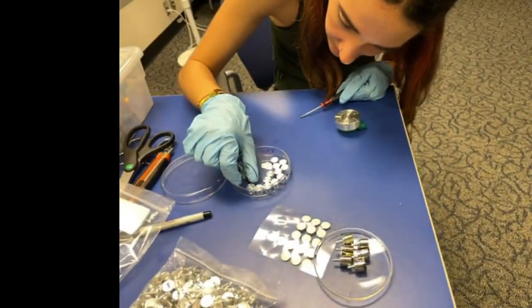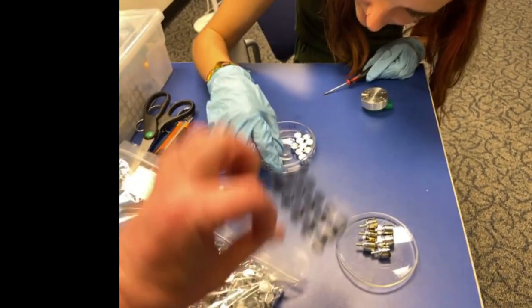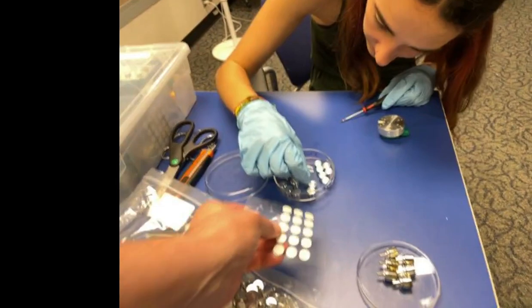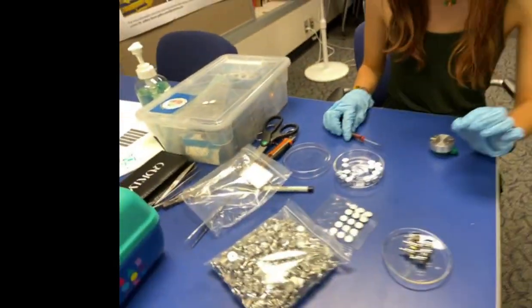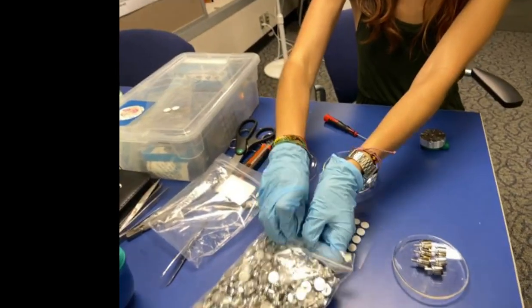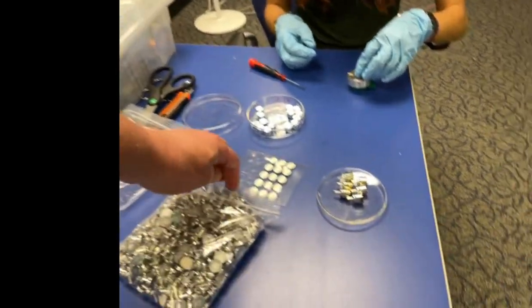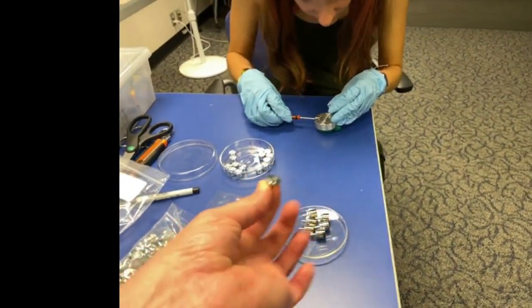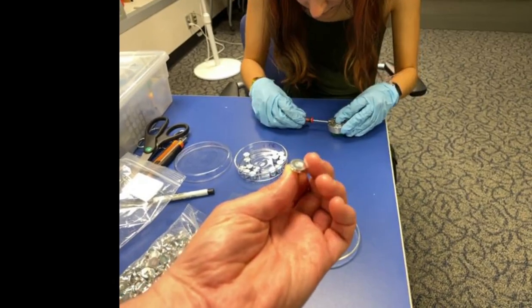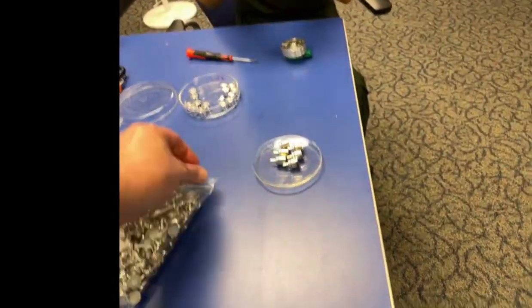And then, so this is the double-sided sticky tape that we use, carbon tape, and it's sized to fit under those. And then these are the little T-shaped stubs that the samples sit in the actual carousel in. And we're just putting a little piece of tape between the sample and the stub so that they look like these when they're done.